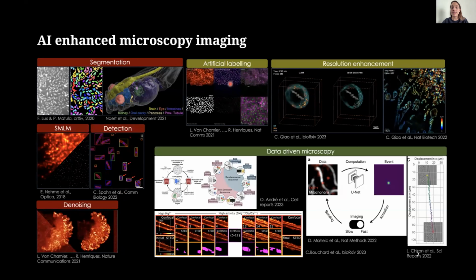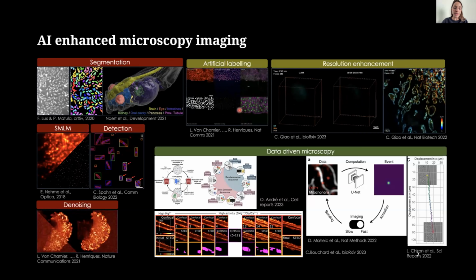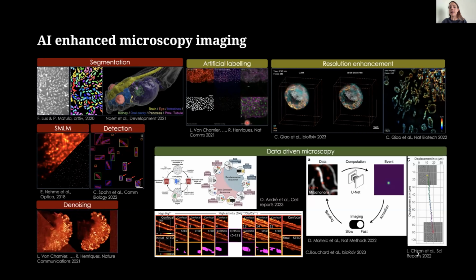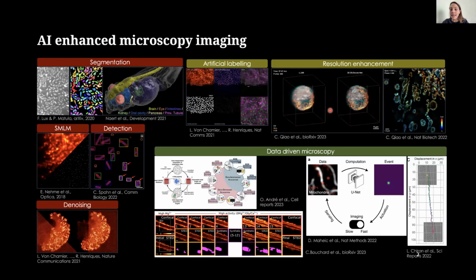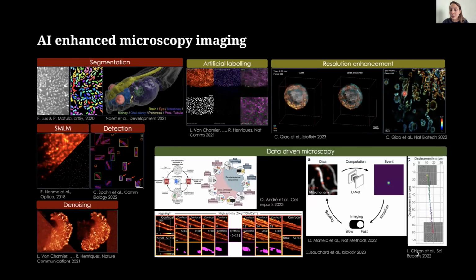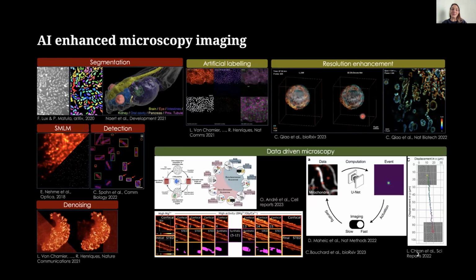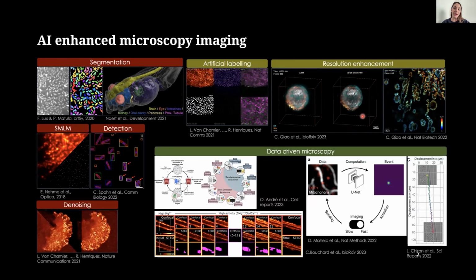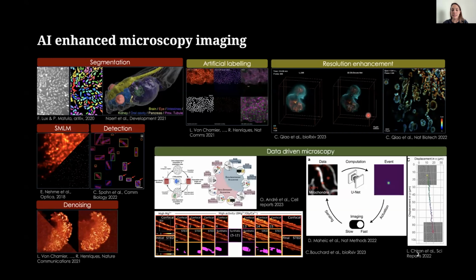So we can actually use the fact that networks allow us to enhance very specific signals from the images that we are analyzing, like different channels or information that we would double with fluorescence, for example, or with different colors depending on the optical setup that we are using to image. We can actually enhance resolution. And here you are seeing some mitochondria and some cells, but of course this happens even in your smartphones if you are using an iPhone to correct the quality of the pictures that you just took. So what I'm showing today is really oriented to microscopy, but it's generalizable to any sort of imaging setup.